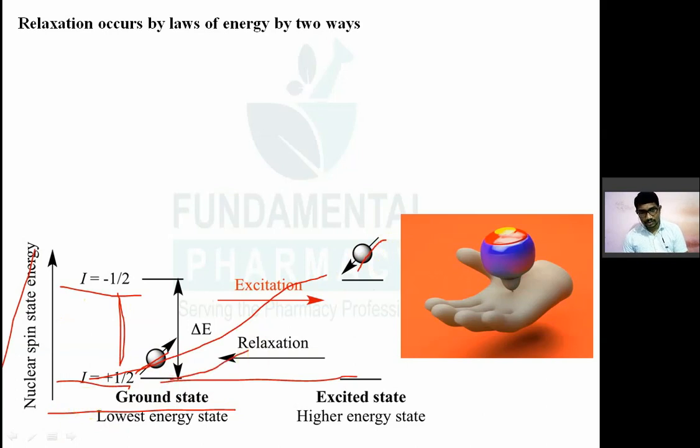So that is known as excitation. Okay, ये एक्साइट हो जाएगा, उसका स्पिन स्टेट चेंज होगा, और जो ऑलरेडी नेगेटिव है वो उसका भी एक्साइटेशन, ओके स्पिन स्टेट चेंज हो जाएगा.